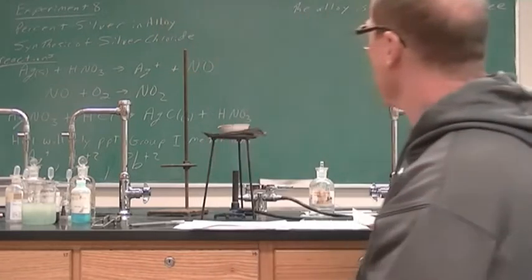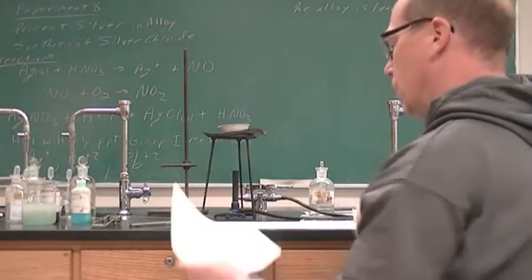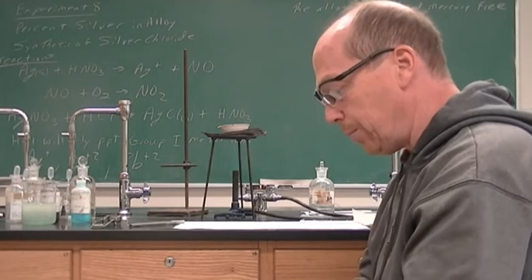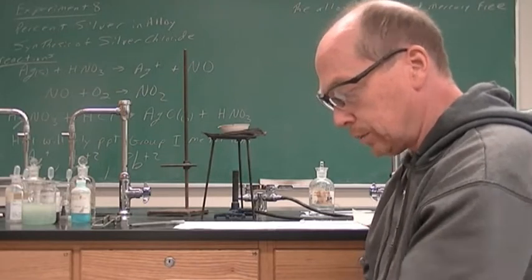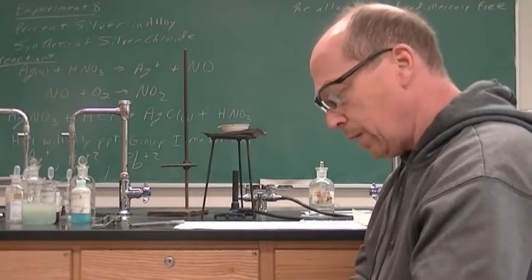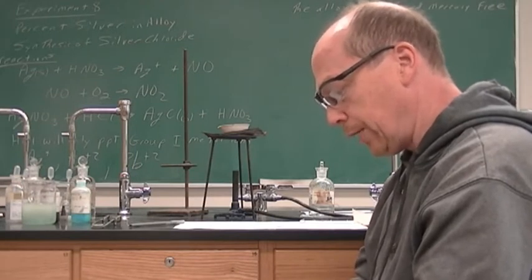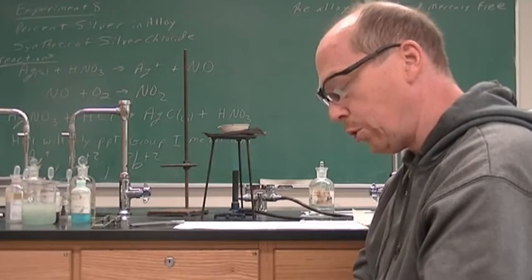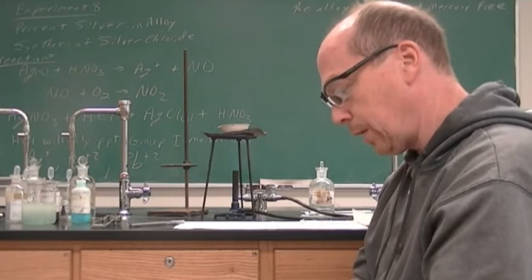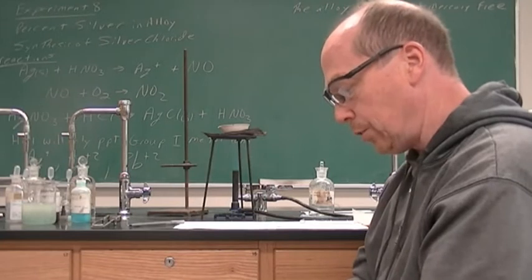All right. Your reactions, there are reactions listed on the bottom of the page. Assuming you have the same page, I'm going to probably update this a bit. Your zinc reacted with the ammonium hydroxide. It formed a zinc ammonium complex. As written there, that's not something you would need to be able to predict, and so it is just given to you in this reaction.